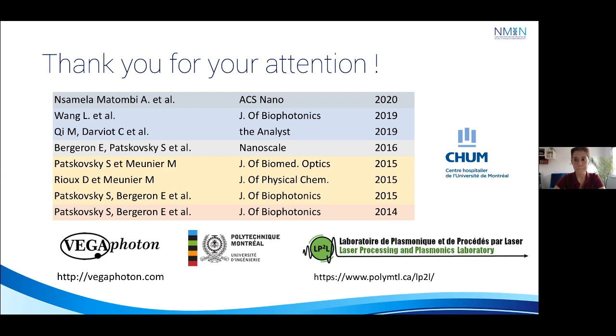I've been mostly working on the imaging part, and it's very interesting to see that the whole project grows, all the parts grow together. So if, for instance, a new type of nanoparticles is used, then we need to go back to the imaging system and ensure that everything will still work together. So I think that's the most challenging part, probably.